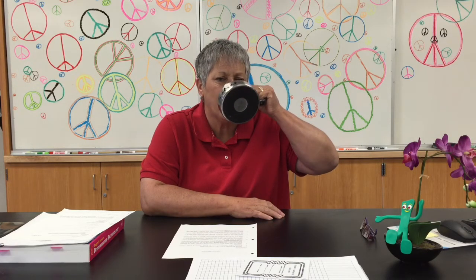Okay, now the next thing you're going to do is, and this is a little different than what we did in the first unknown, and this is going to happen before you do your gram stain, you're going to obtain 2 fresh TSA slants. We usually have a basket of them on the side bench where we usually put the materials. And what you're going to do with those is, before you make any inoculations, you're going to label those tubes. Put your name on both of them, put your culture number on both of them, your lab section would be good, and then on one tube write stock culture, and on the other tube write working culture.